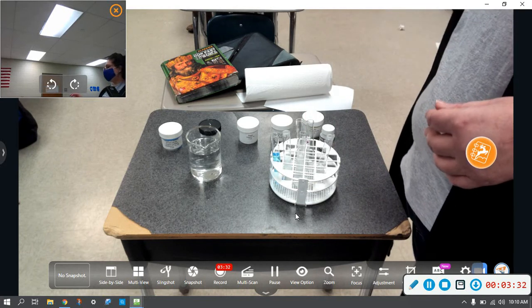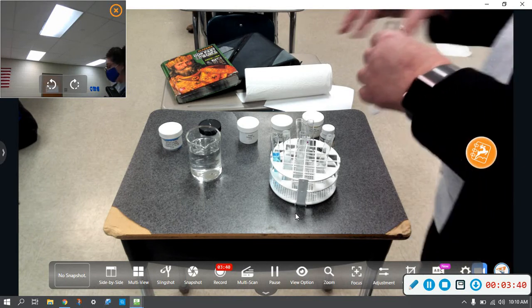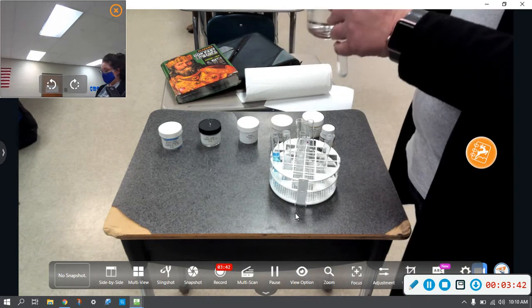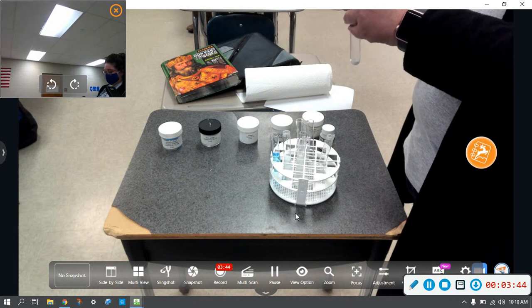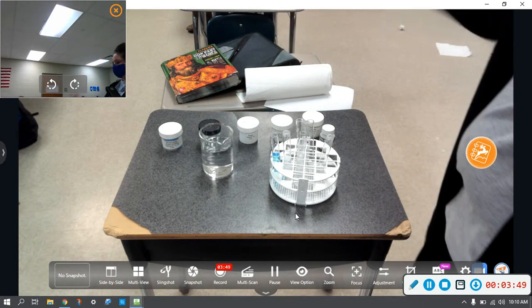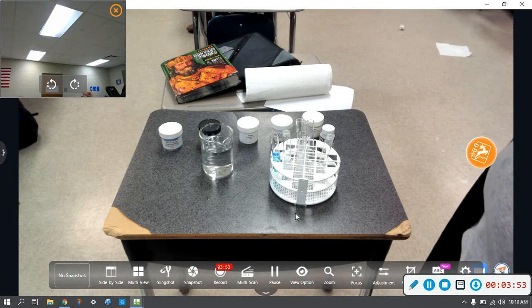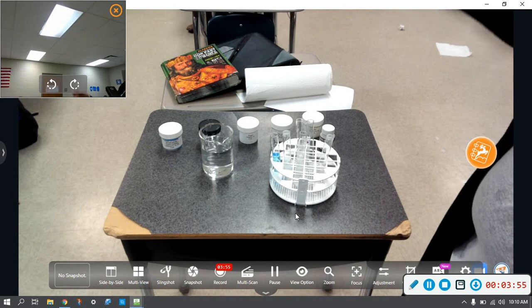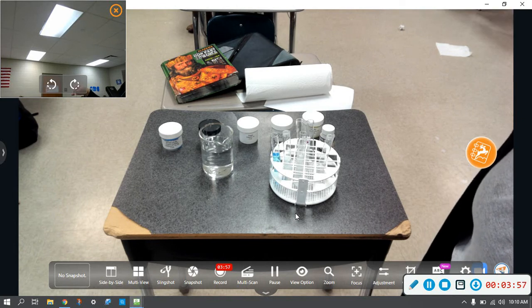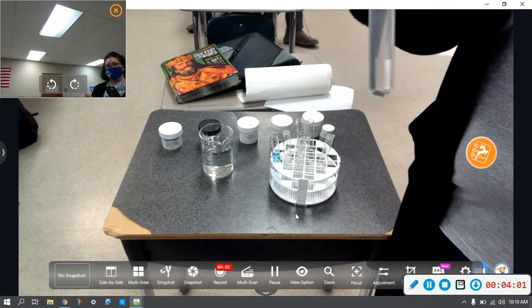Next, I'm going to do sodium chloride. Does anybody know what sodium chloride is? It's salt. Same kind of salt that you use at home. What do y'all think it'll do in water? Oh, it's definitely dissolved. Well, you've seen it happen before, haven't you? Okay, so as I'm shaking it up, you can see that it's definitely dissolving, and all of it has dissolved.